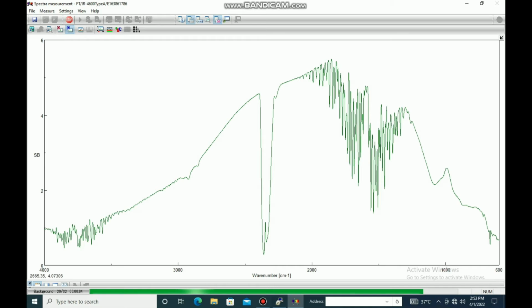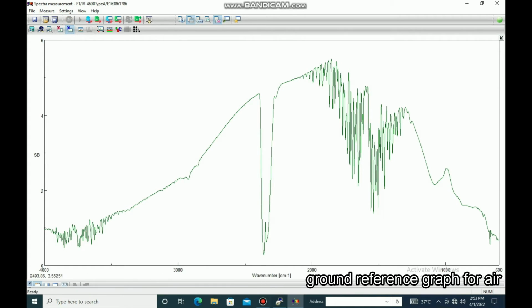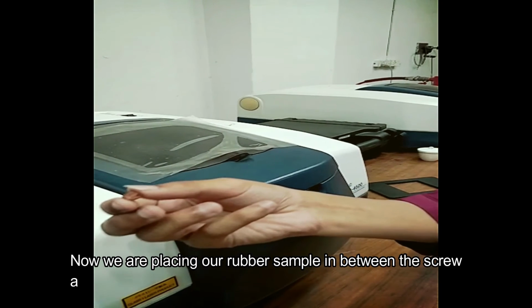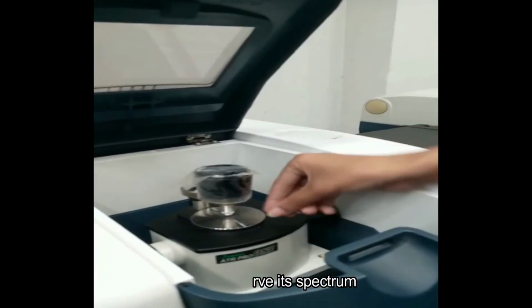A few moments later, scans are completed. Now this is the background reference graph for air. Now we are placing our rubber sample in between the screw and the diamond crystal to observe its spectrum.